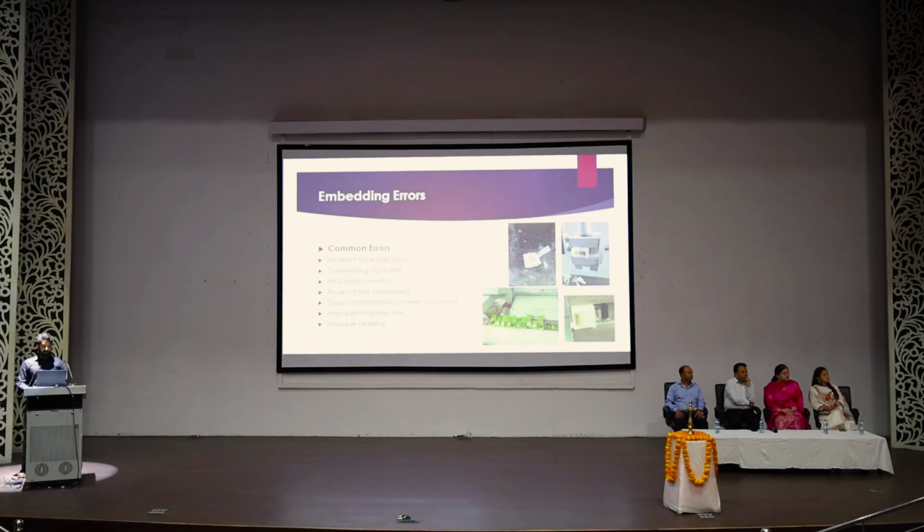The next is improper mold selection. Improper molds cause not only wastage of time and reagents, but also affect the section cutting and staining quality. The next one is improper labeling. As I said, in this image you can see multiple tissue cassettes have been opened at a time.